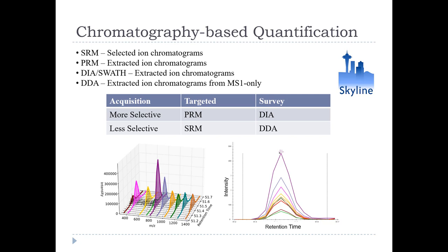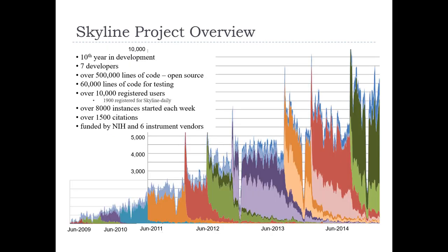There are other methods that people use, like spectral counting and isobaric tagging, like TMT and iTRAQ. Okay, long-winded on a single slide. I'll try to go a little bigger.